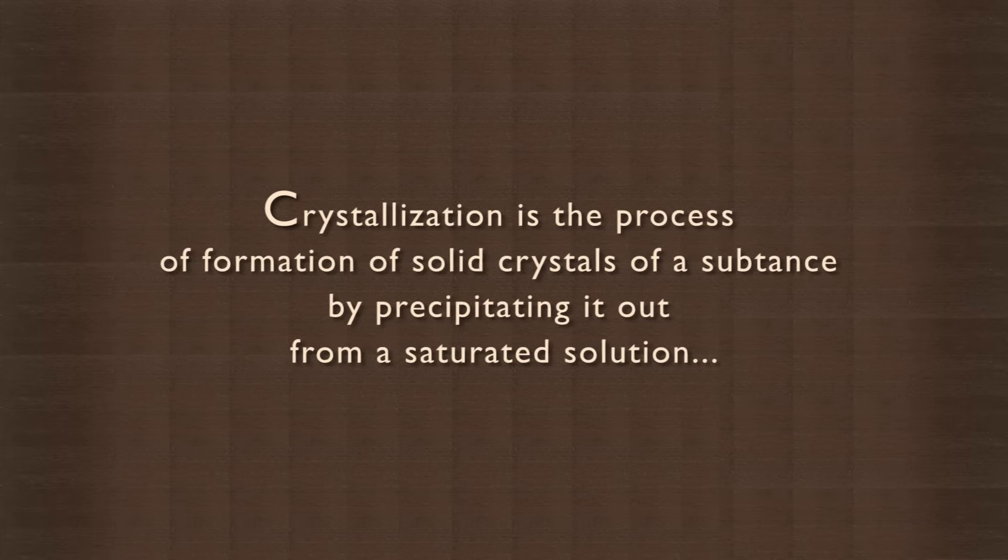Crystallization is the process of formation of solid crystals of a substance by precipitating it out from a saturated solution.